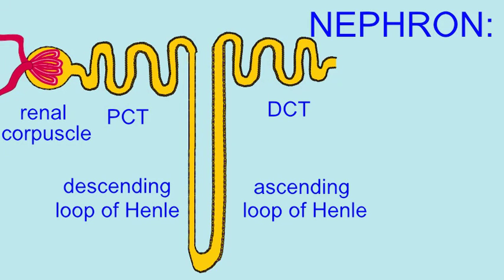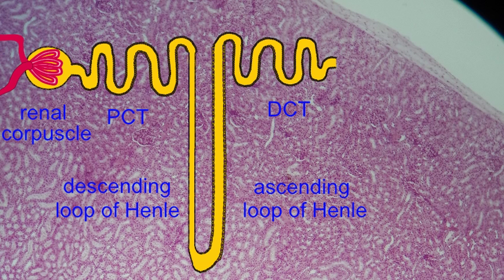Nephrons are the functional unit of kidneys. Each kidney possesses about a million of them. When one examines the kidney under the microscope, one can clearly see the sections of nephrons in the renal cortex and the renal medulla.